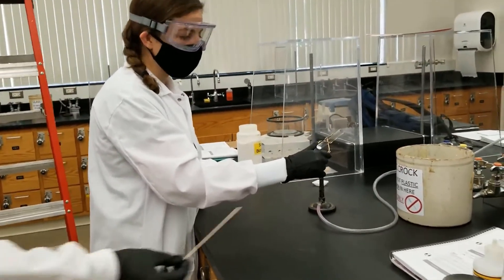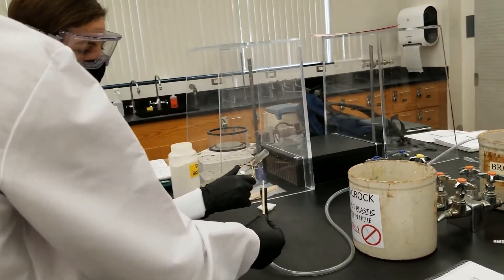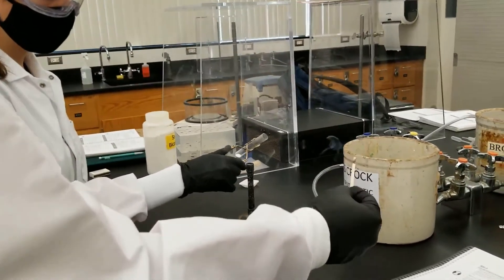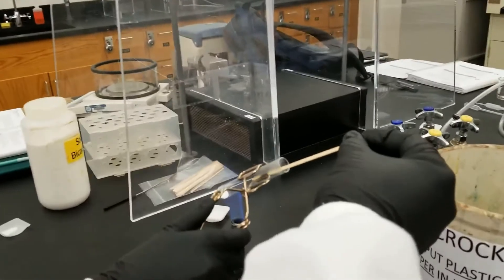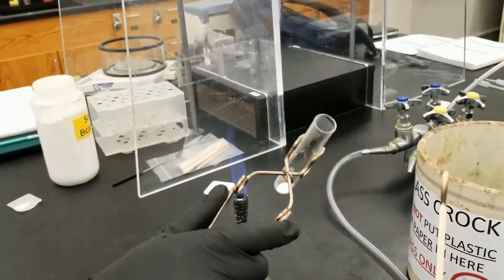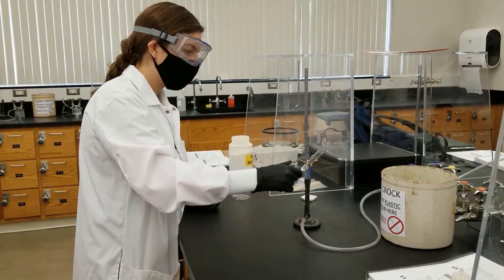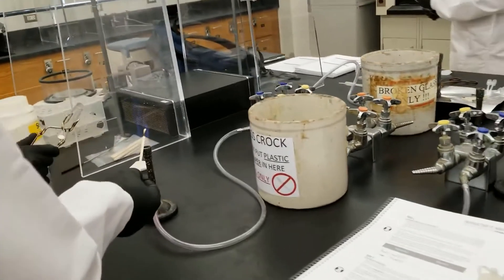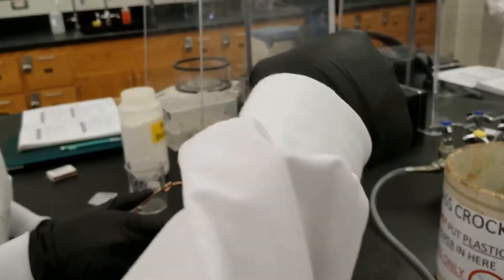Now we are going to do a glowing splint test. Let's see if we see anything. Nothing happened. So now we are going to do the burning splint test and stick it in and see what happens.